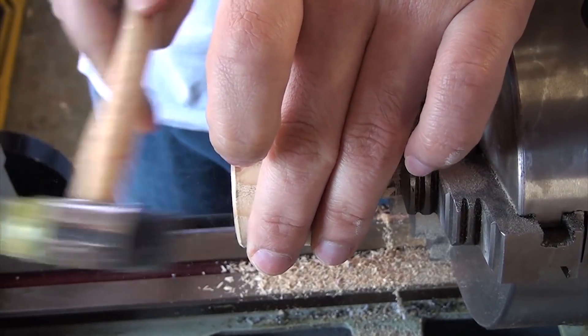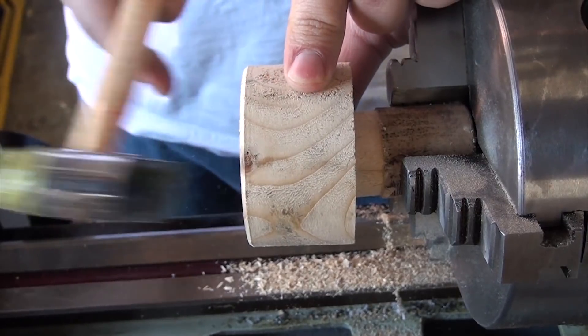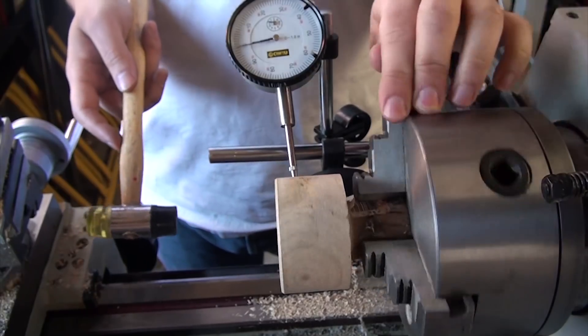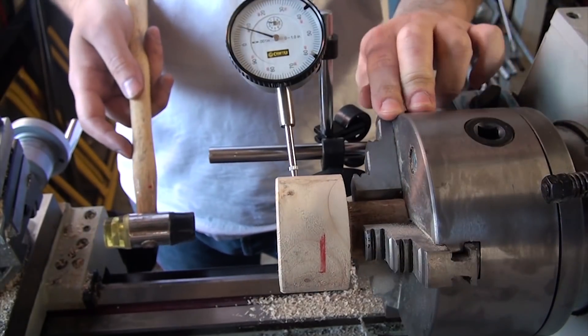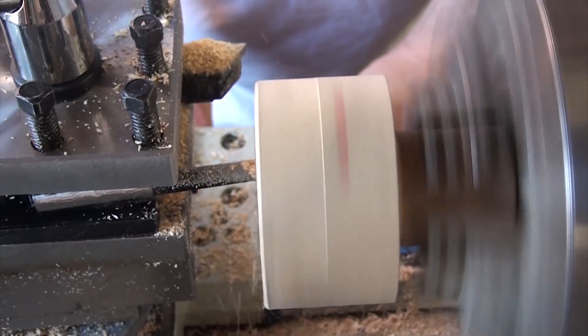I ended up making a wooden mandrel to fit this back onto the lathe so that I could cut a disc the width of the gear belt to make the final gear. I also took a skim cut to make sure that everything was concentric, as even though I'd taken the time with an indicator to make sure the part was running true, I knew it was a bit off.